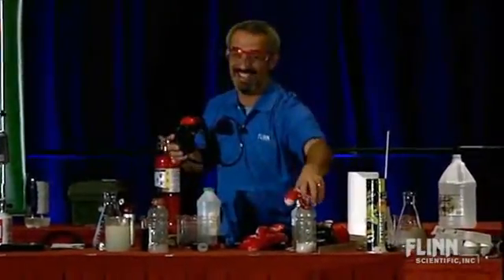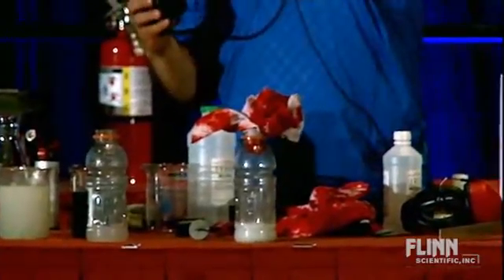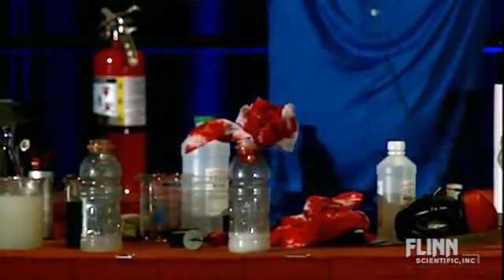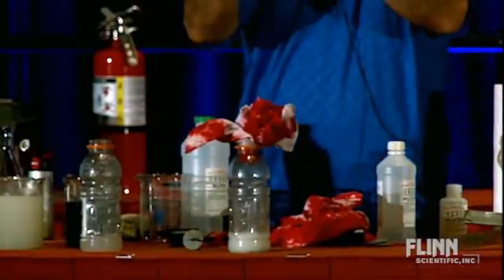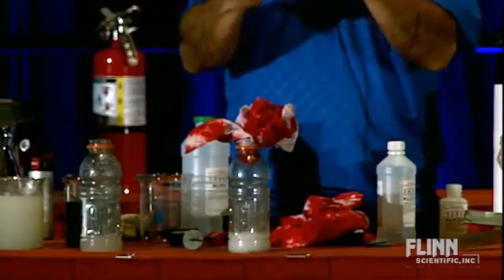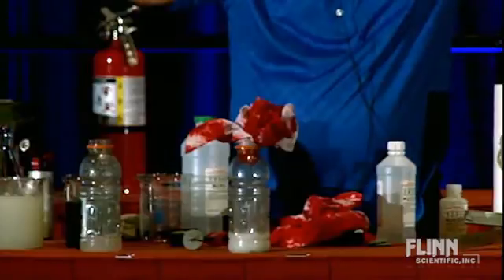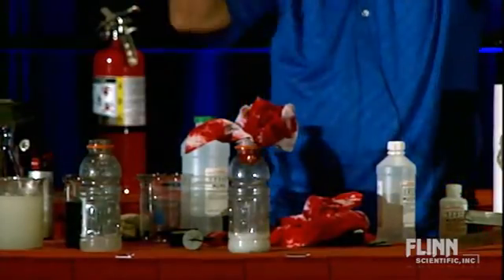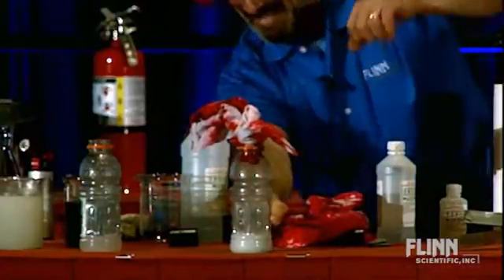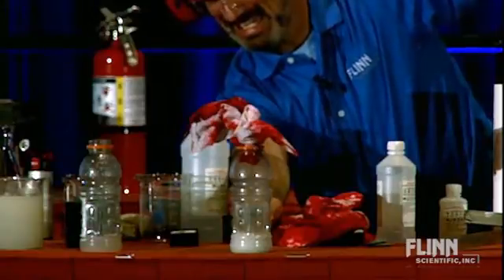Remember what this next bottle has in it? Five times as much. So you ready for this? I'm making doubly sure that my ears are protected. We're not taking any chances — cover those ears. Ready? One, two, three.